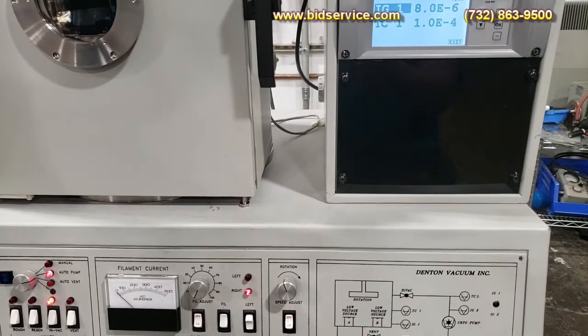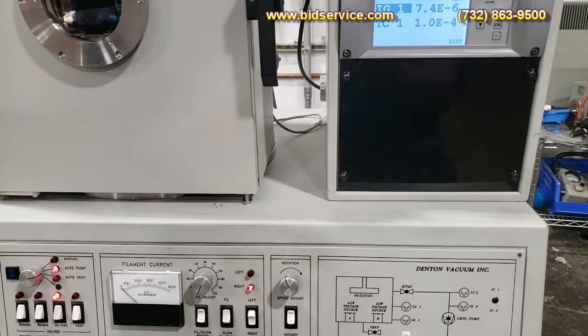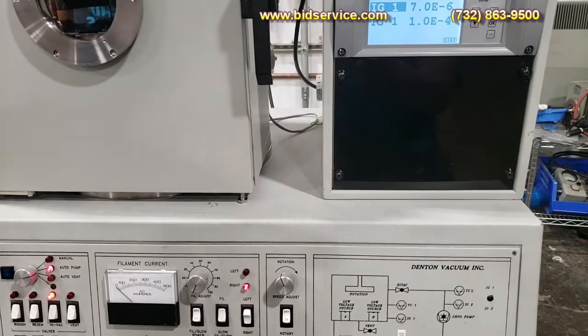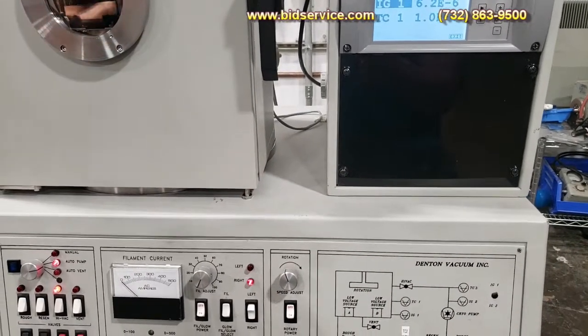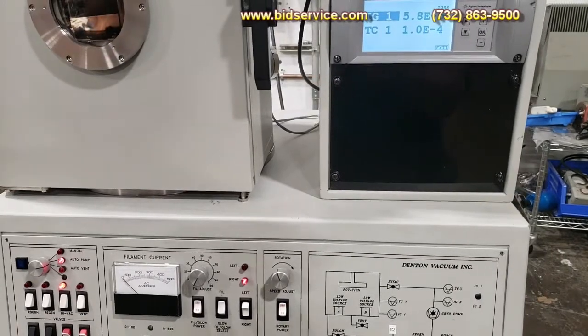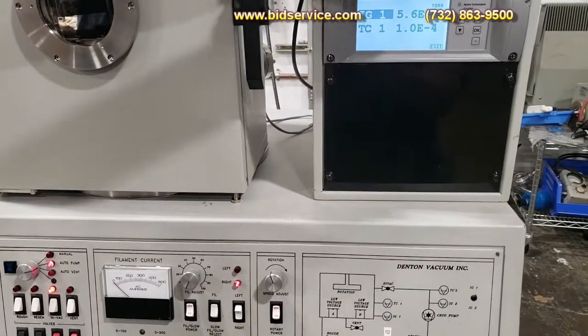A lot of people will leave the system under vacuum like this between depositions until their next run. We'll come back later and do an actual aluminum deposition using the Inficon XTC2.